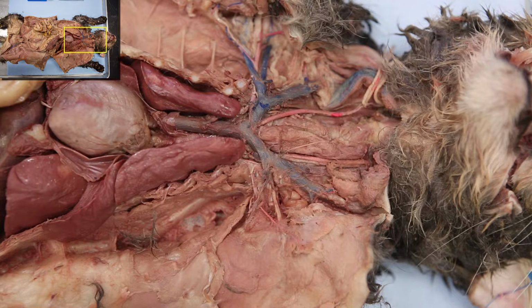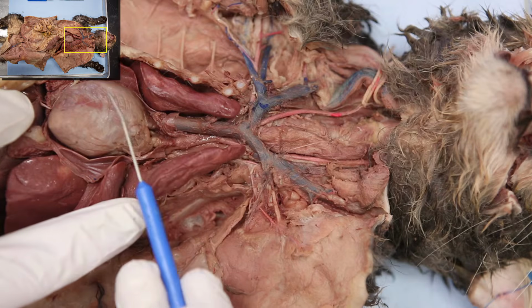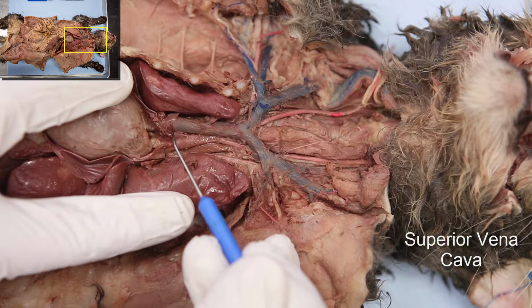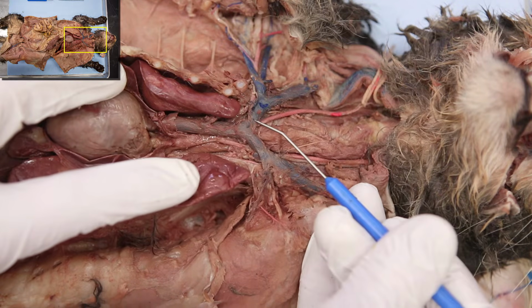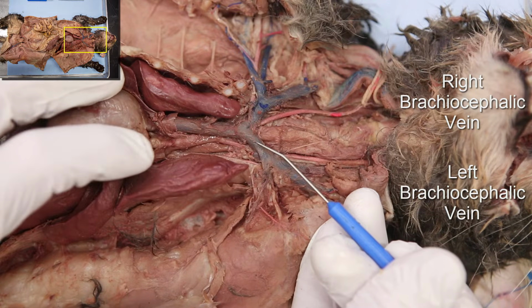This is going to be a view of the upper thoracic region of this cat. What we're looking at is the heart right in the middle here, and we can see the superior vena cava coming up. The branching here, you can see, is the right brachiocephalic vein and the left brachiocephalic vein.